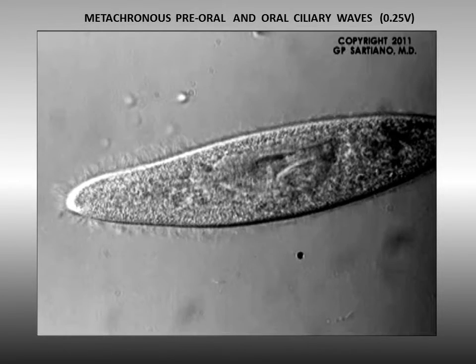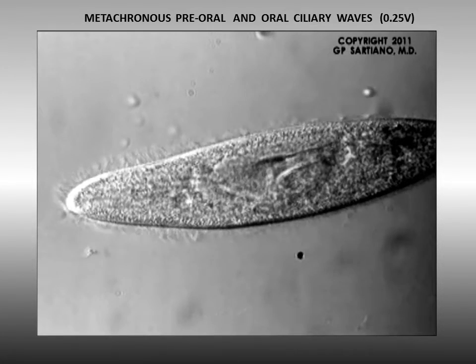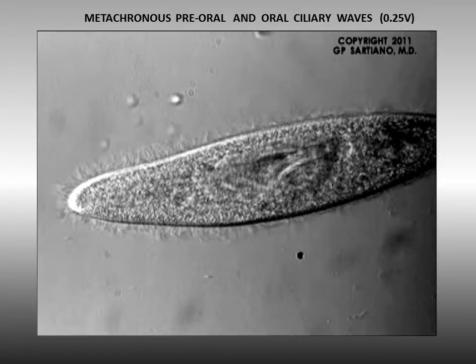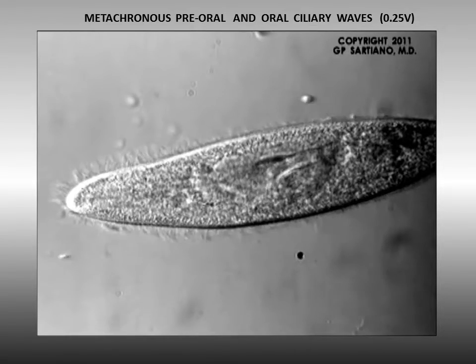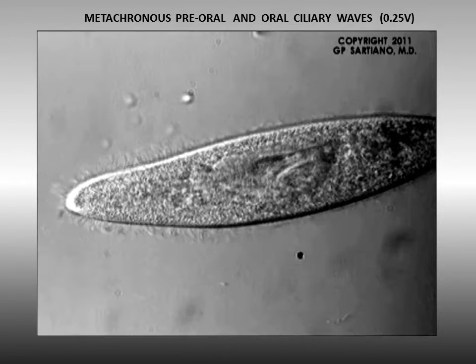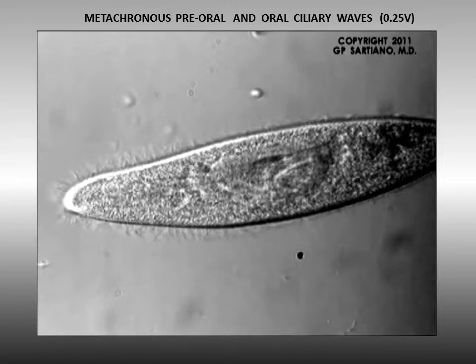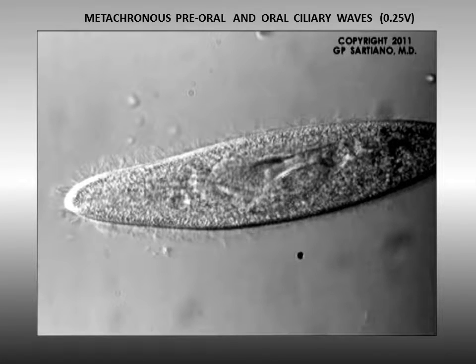The dark dot-like objects deep in the plane of the buccal cavity are apparently kinetosomal bases. The continually powerful movements of the buccal ciliary groups maintain one-way flow of particles into the forming food vacuole. This observation is documented from several perspectives in this video and others to follow.